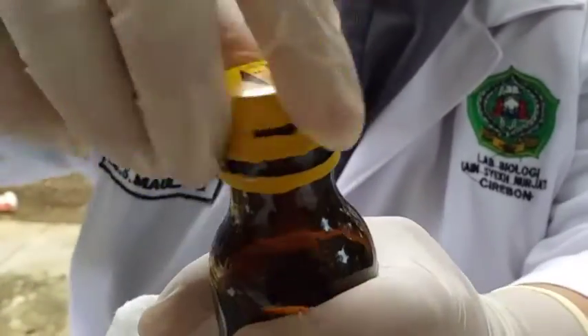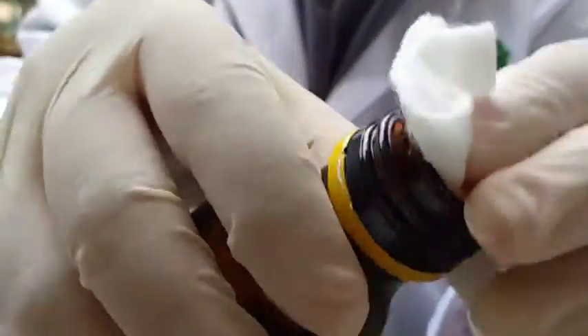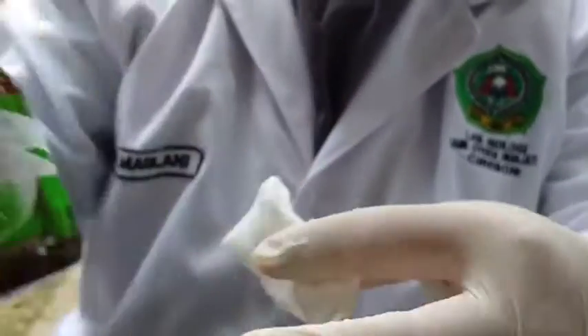Selanjutnya, teteskan formalin ke kapas. Formalin 5%, kemudian tutup kembali sampai rapat.